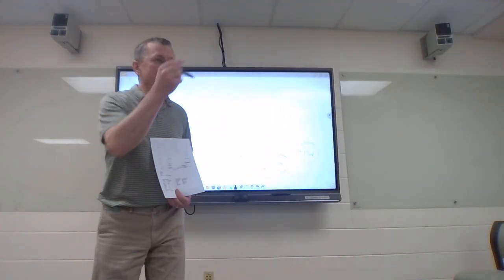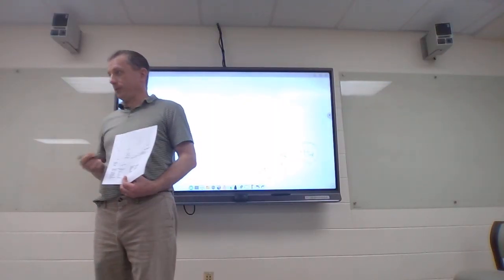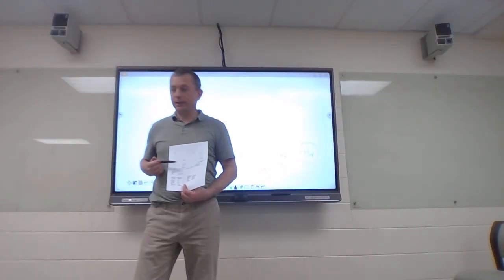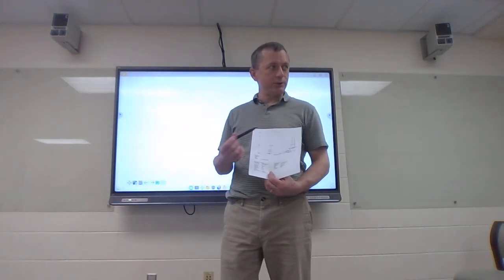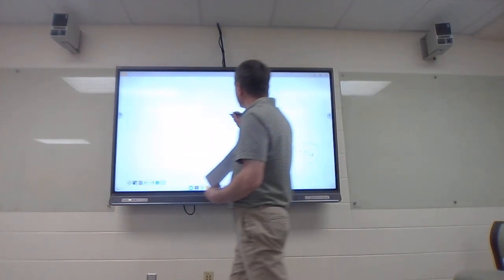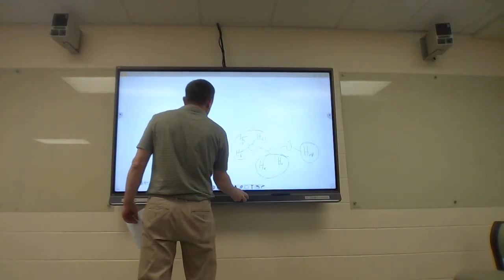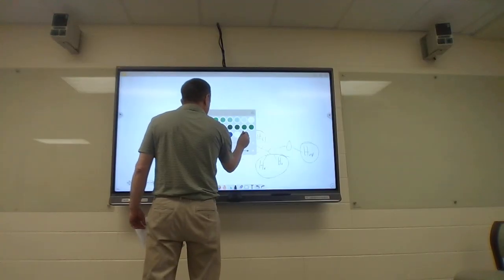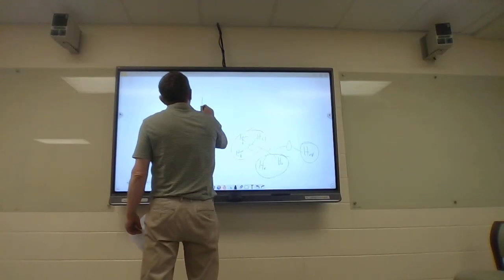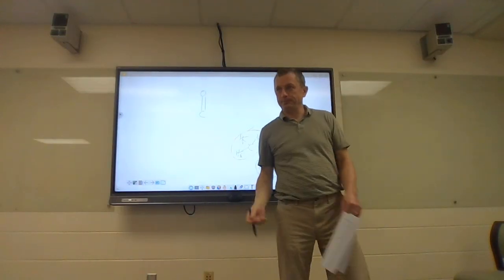So I am not going to put a hydrogen on an oxygen here because it's not in my IR. But I do have that carbon-oxygen double bond stretch in there. So you can start by drawing a carbon-oxygen double bond.